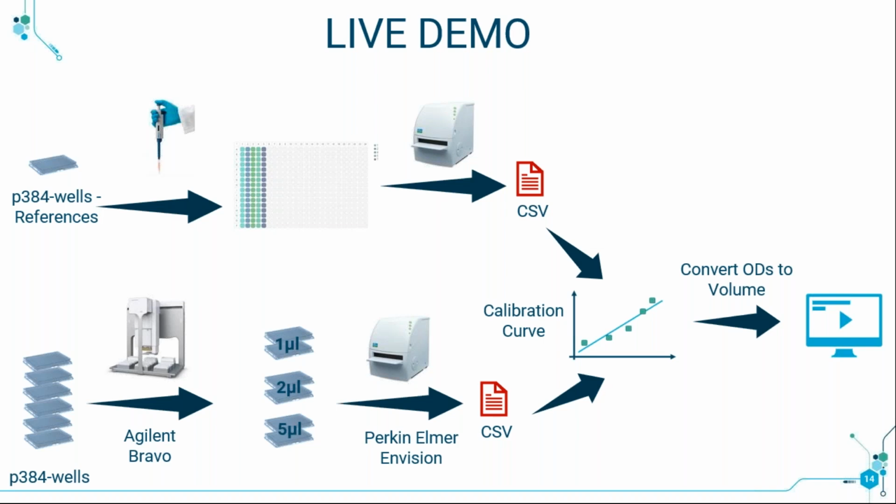And I'm going to use this raw data to do a fitting procedure to get some parameters to convert optical densities to volumes, because it's way easier to speak in terms of volumes than optical densities.